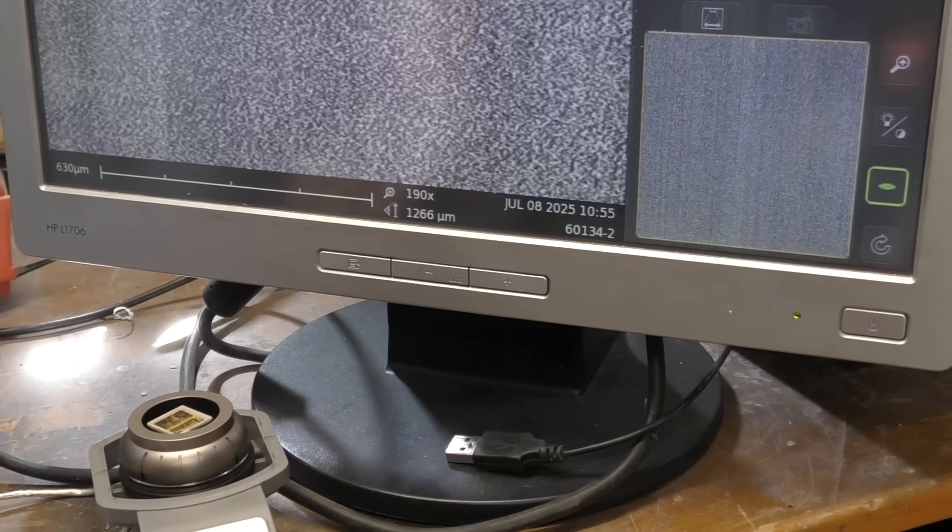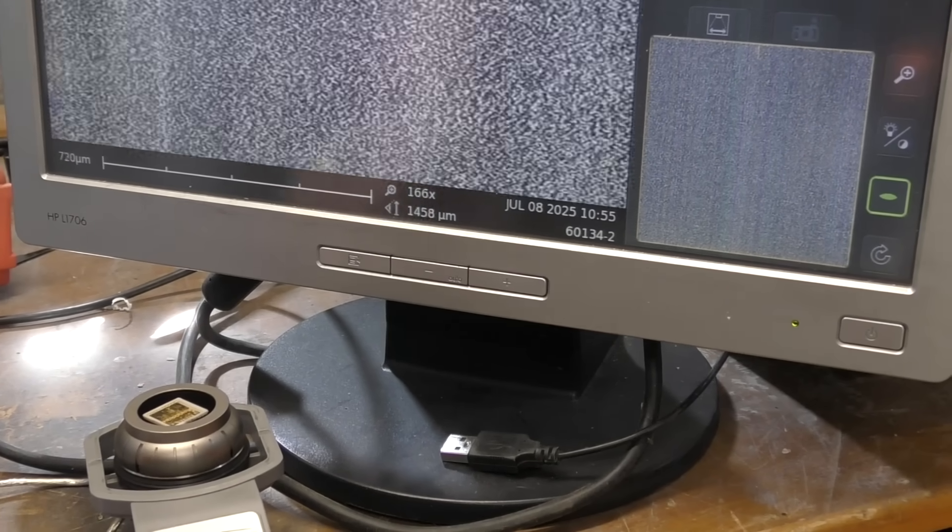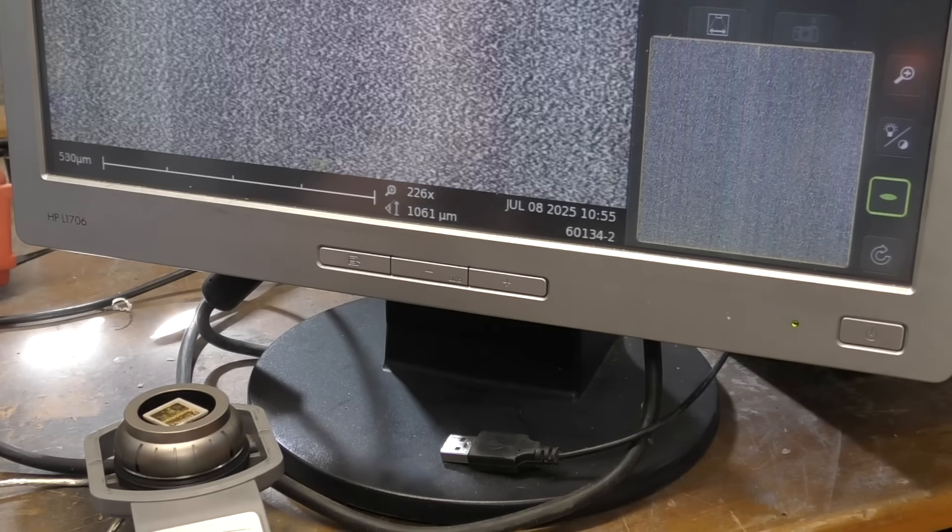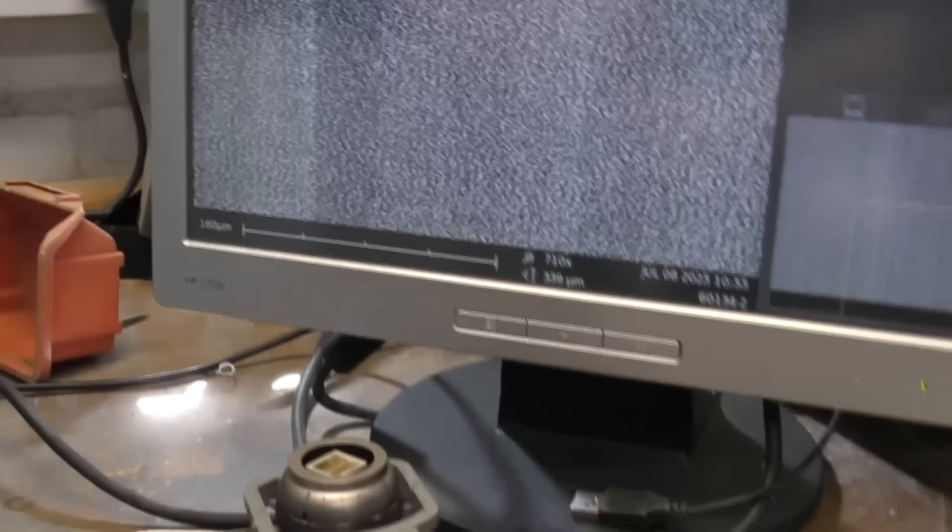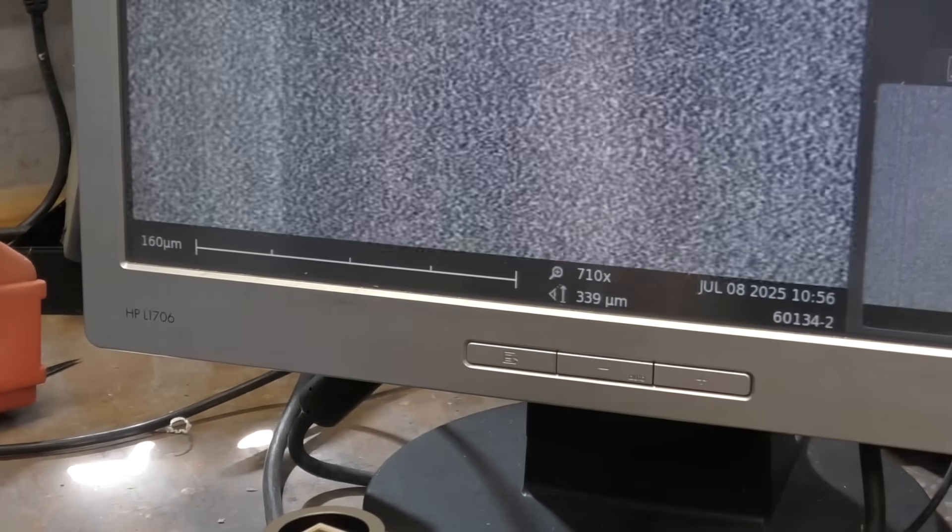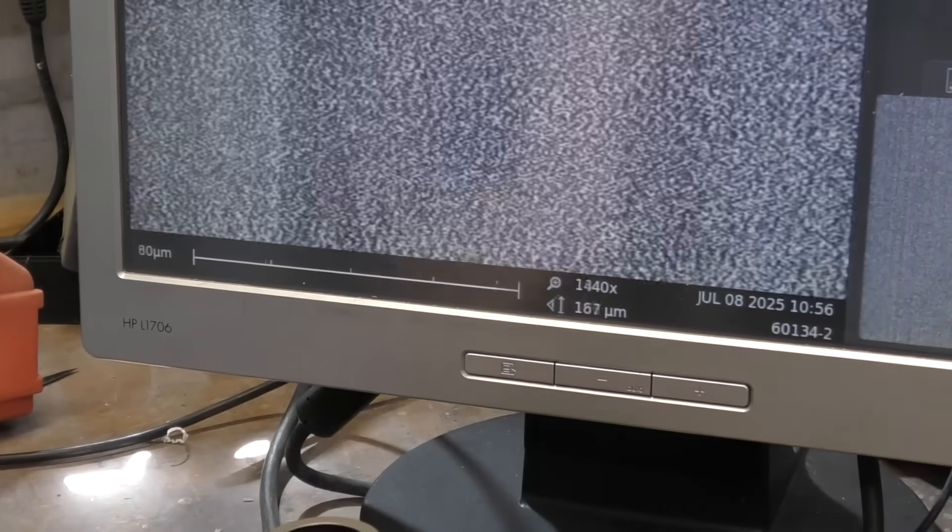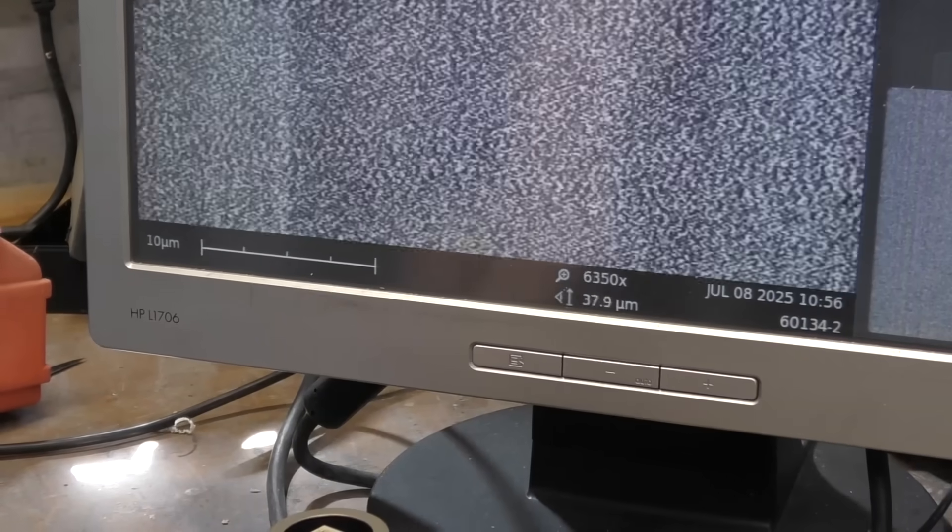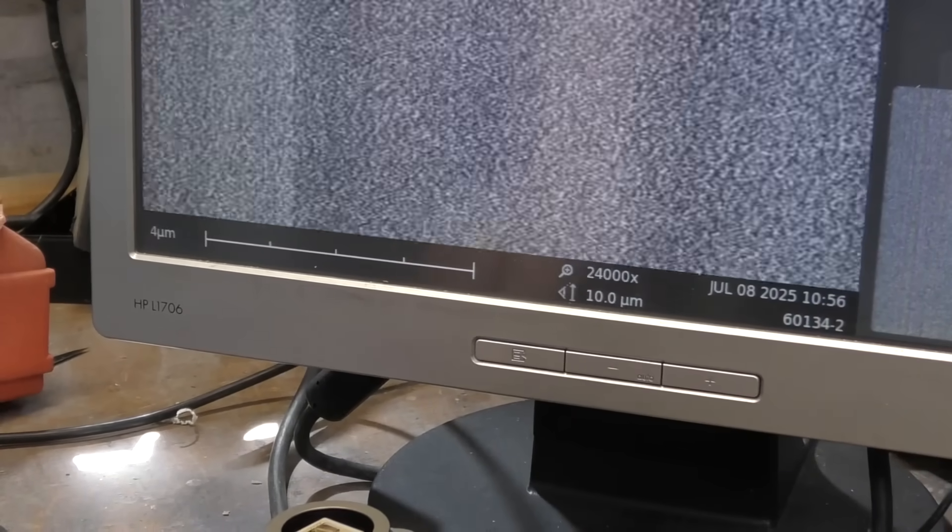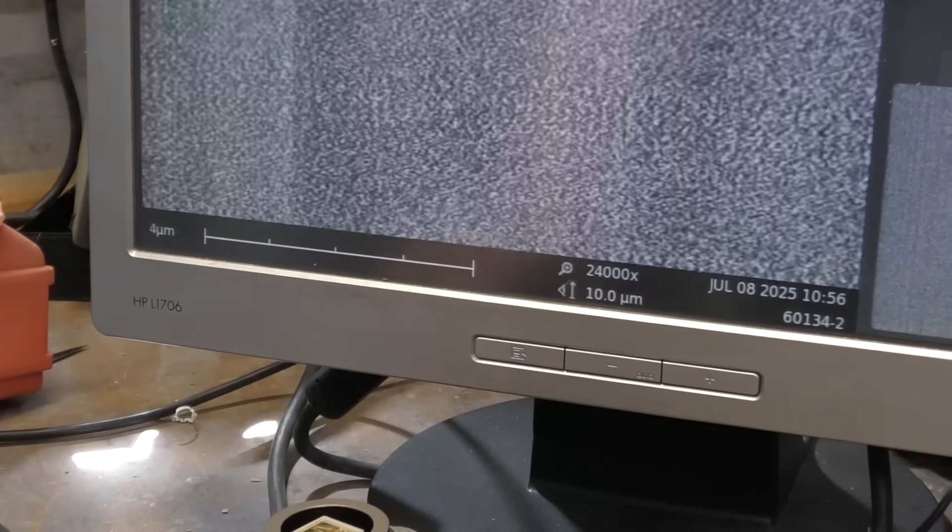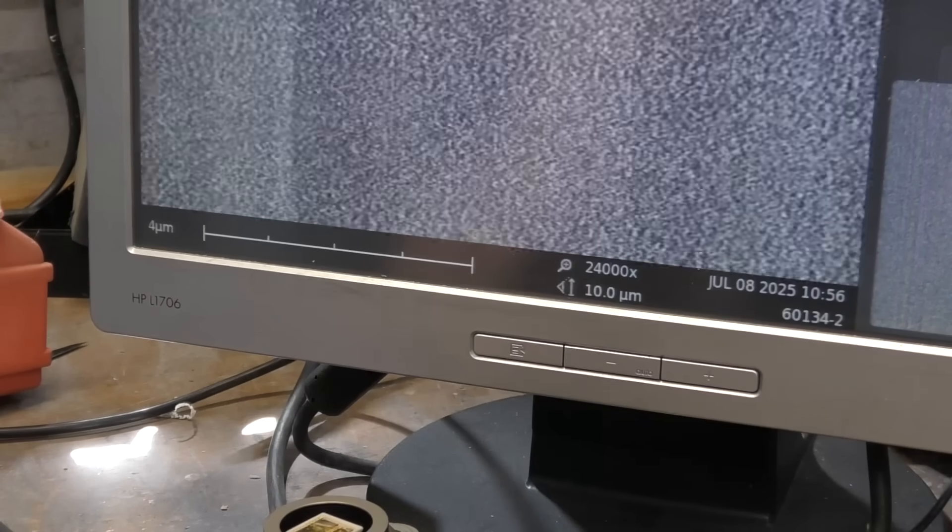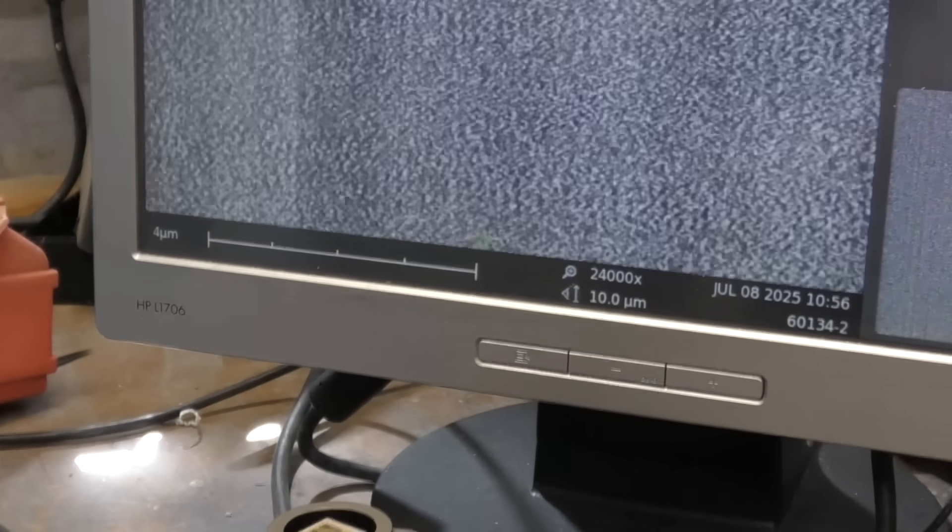The focus and magnification controls make no difference whatsoever. The thing we can do though is adjust the magnification to see what this is in theory capable of doing. If we go up to 4, we're looking at 24,000 times magnification. Yeah, 10 micron field of view.